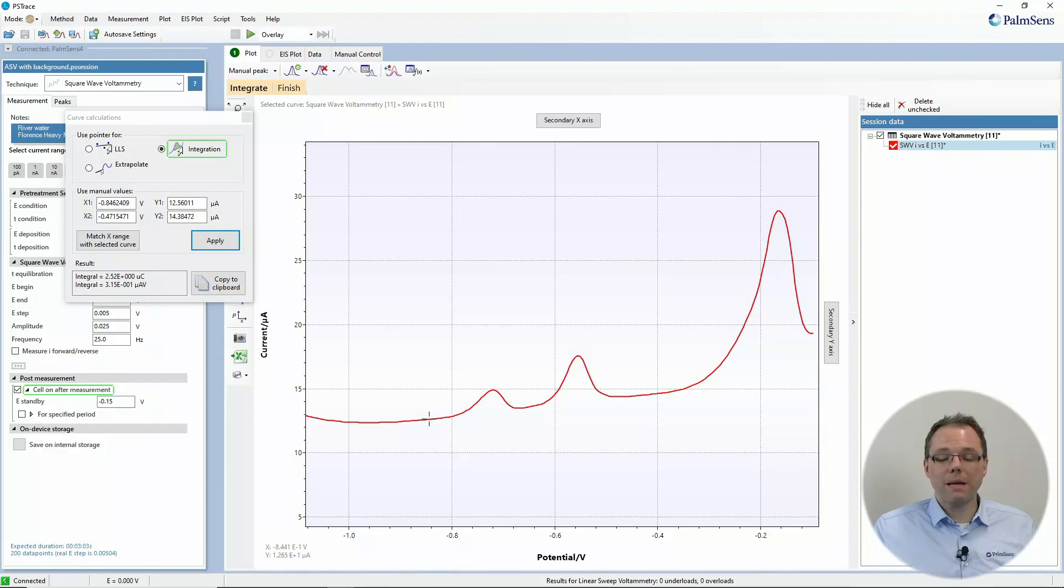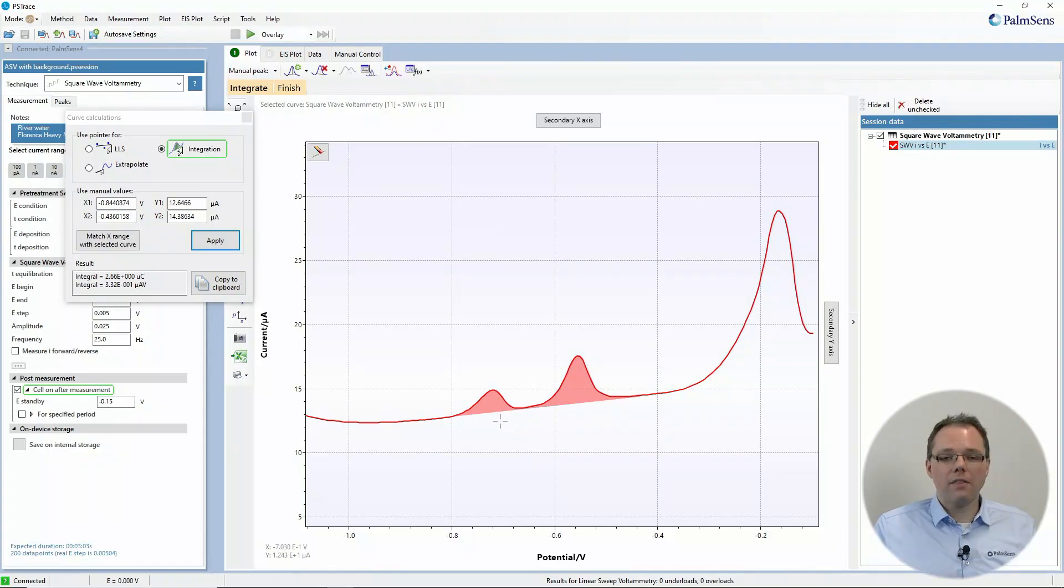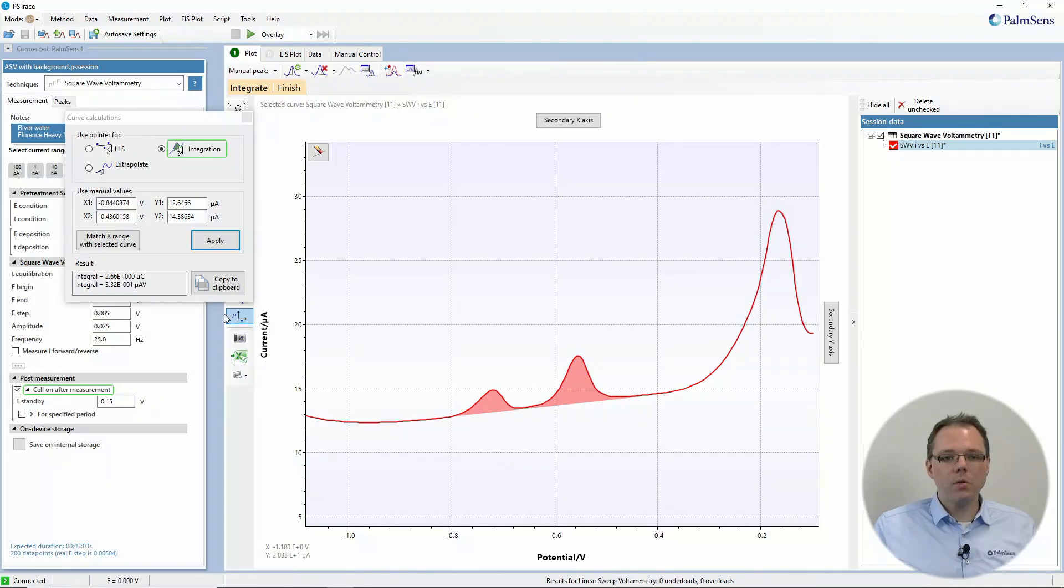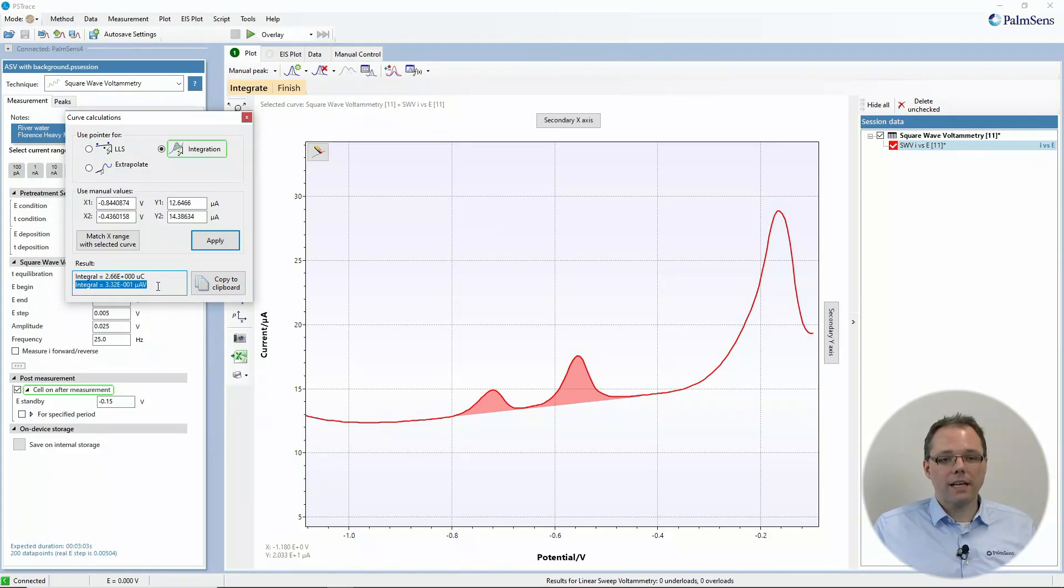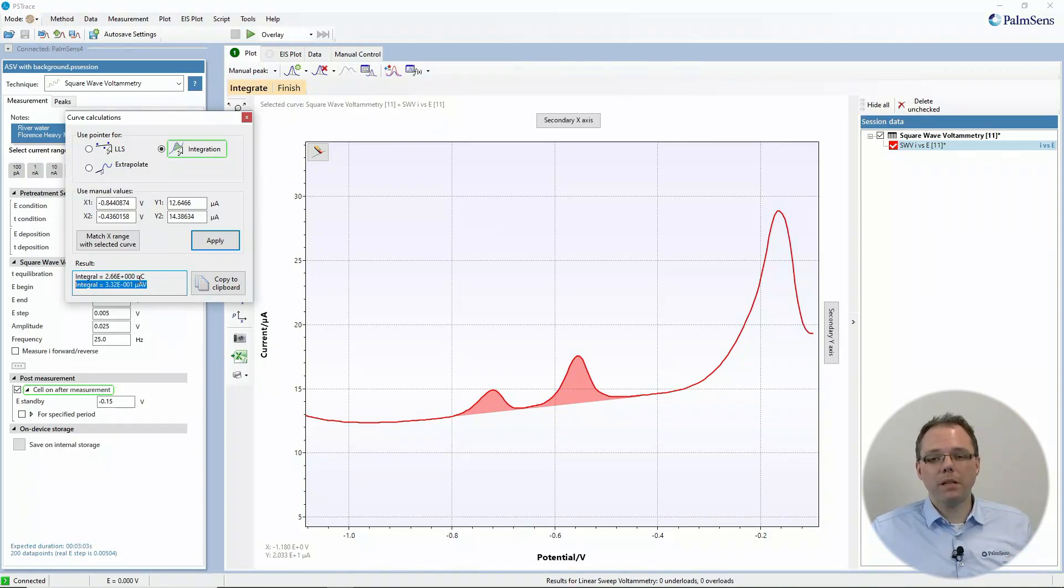And I want to calculate maybe that charge to calculate how much I deposited. I just draw a line and then the software makes the integral between the curve and that line. You immediately get the result and the real result of your integration is of course here, which is then in the unit ampere volts. However, most people are interested in the charge.